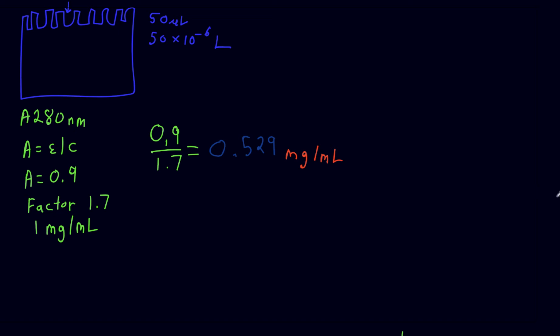But we want to go a little bit further, and we want to basically take that protein and run it on the gel. And so what we're looking for when we run on the gel is, if we don't have a lot of protein, it may just be very light. You may not see much at all. If we have a large amount of protein, you may see your protein of interest, but it's just really big. It kind of even goes into the other lane sometimes. So what we want is just a nice, sharp band. And in general, this doesn't always apply, but you can usually use about 10 micrograms of protein in order to get to that level. So how do we calculate 10 micrograms of protein?